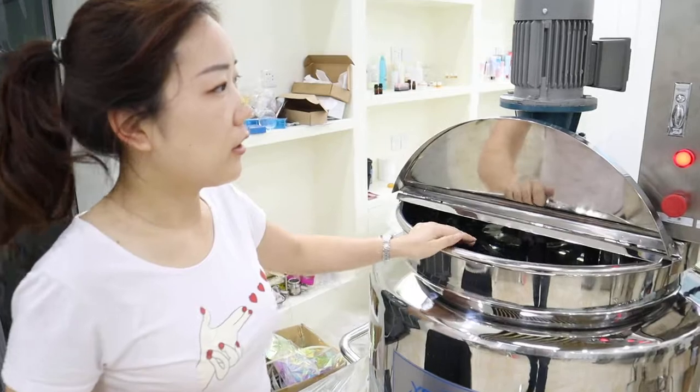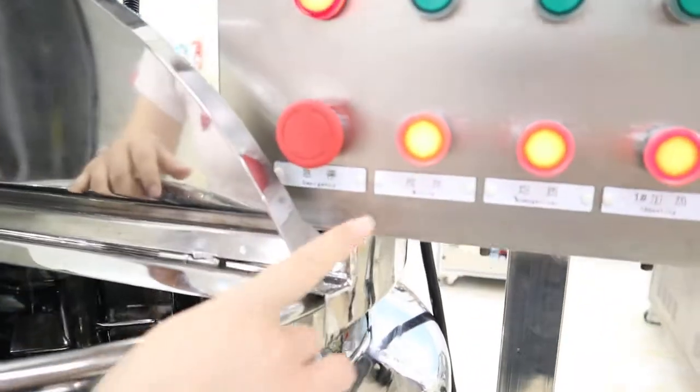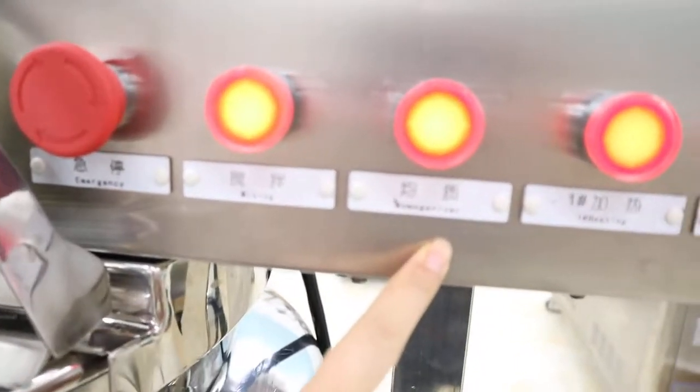This is a 100L mixer tank. This machine is already connected with the power. This is the mixing and this is the homogenizer.